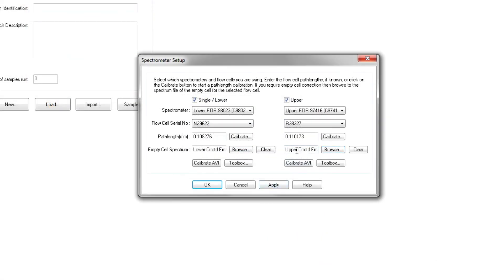Verify that we have the correct one here, and select apply and OK.